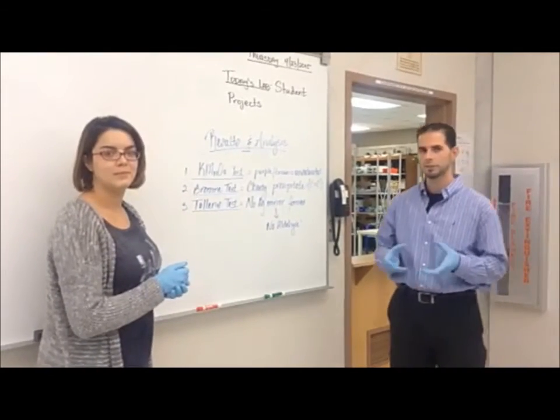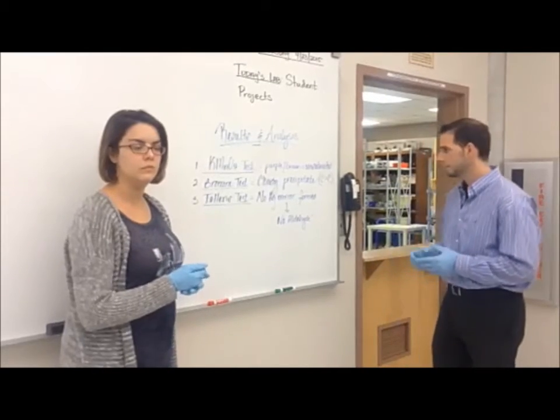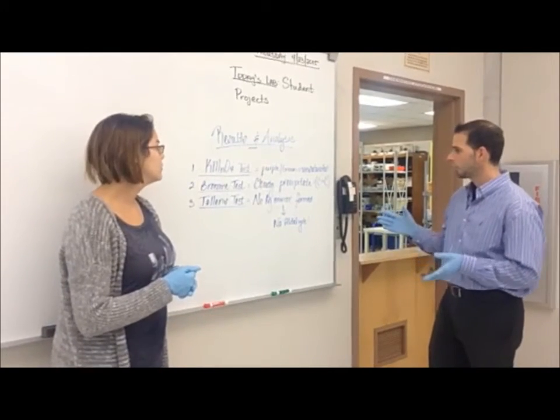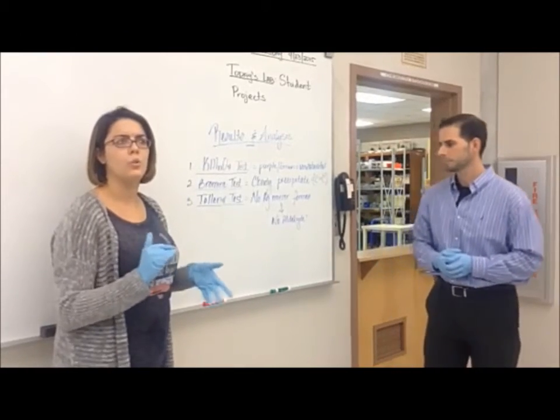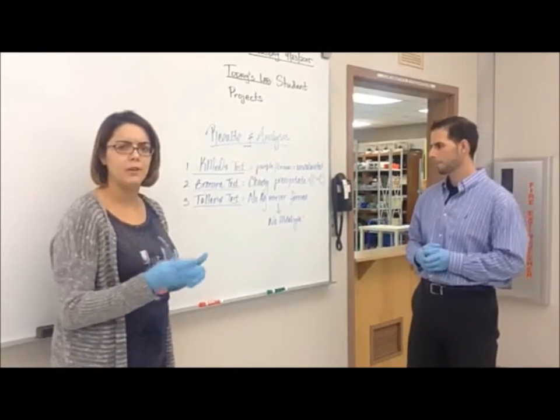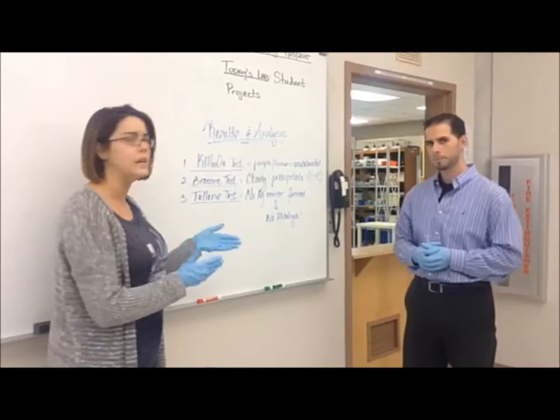The bromine test showed a white cloudy precipitate that was formed, and that's indicative of having either a carbon-carbon double or triple bond. Alright, so after doing test 1 and test 2, we kind of have an idea of the compound that we were going to get, but we decided to go ahead and perform the Tollens test.